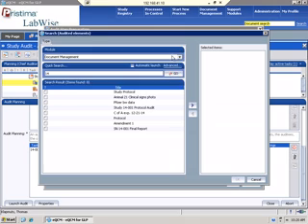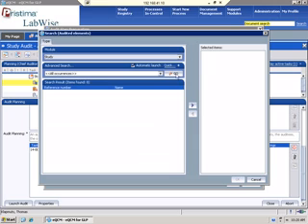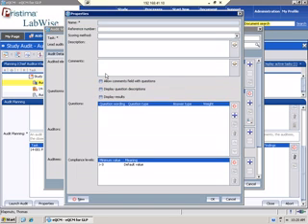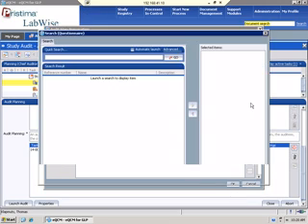The audited element here, what I can do is go in to look at my study registry. And in my study registry is a list of all my studies. So here I can pick my study, and now I'm linking right into my study registry from my audit. Questionnaires, I can go into questionnaires, and this will allow me to create a questionnaire on the fly. So if I wanted to build one as part of my audit, I can name the questionnaire, create a scoring method, give it a description, simple ratio normalized method, allow comments, build my questions, and then build a scoring system. But I'm going to pick one that's already created.